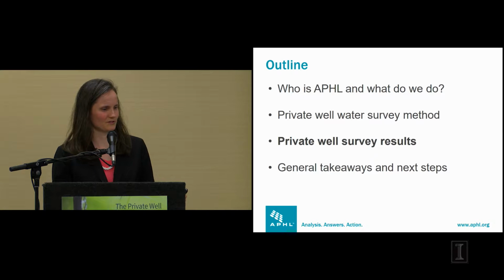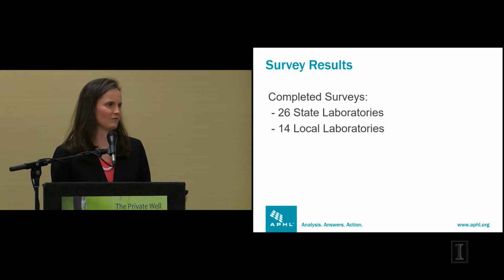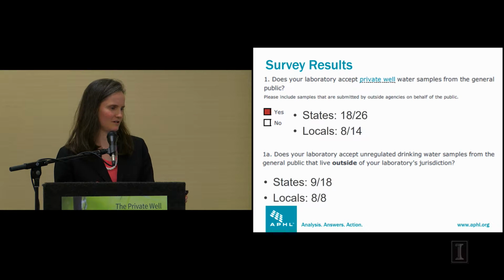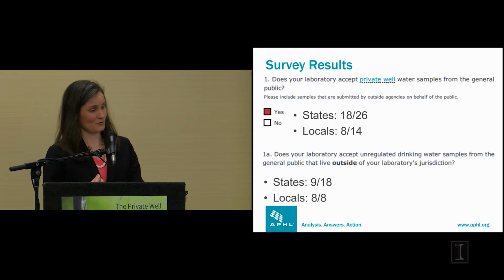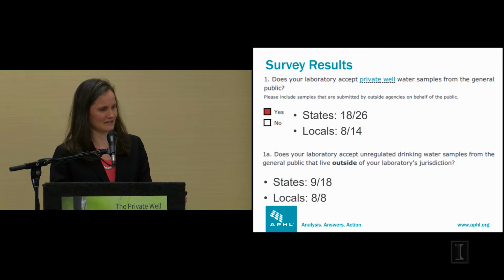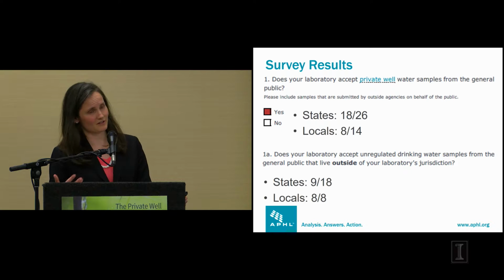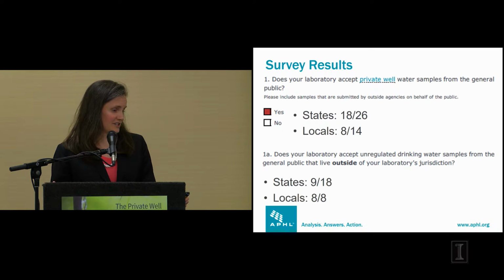And what were the results? What's the good stuff? 26 state laboratories completed the survey, and 14 local laboratories completed it. But then who actually had to finish all those 24 questions? Well, 18 states said that they accepted private well water samples from the general public, and 8 local laboratories did. We're also curious to see, did they accept unregulated drinking water samples from outside of the jurisdiction? Half of the states did, but all the locals, and you can imagine that's because of distance.